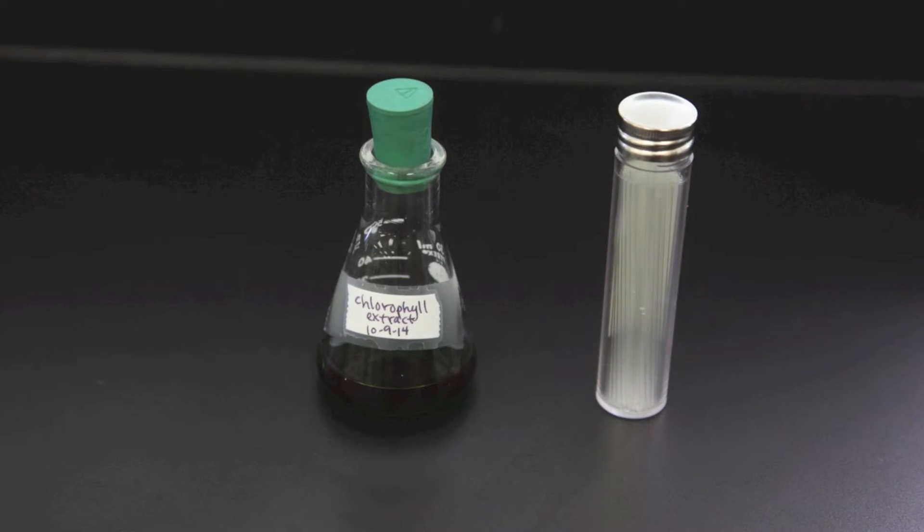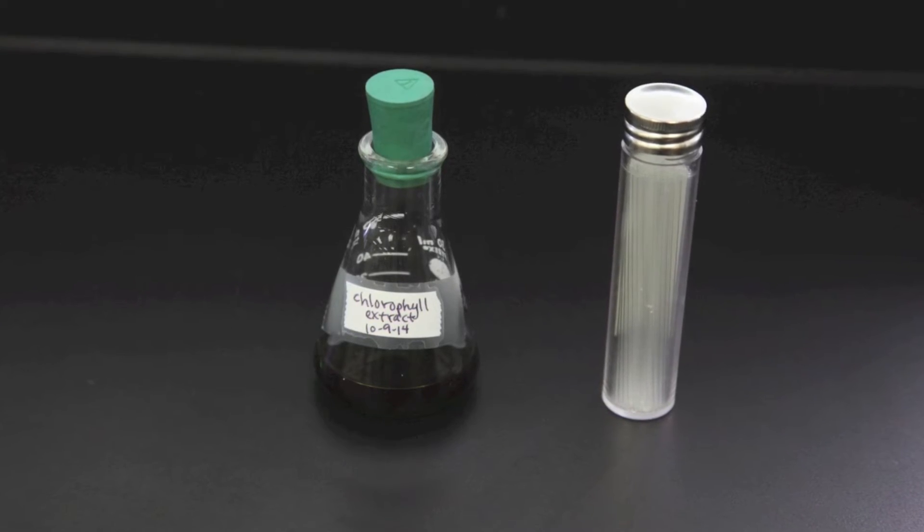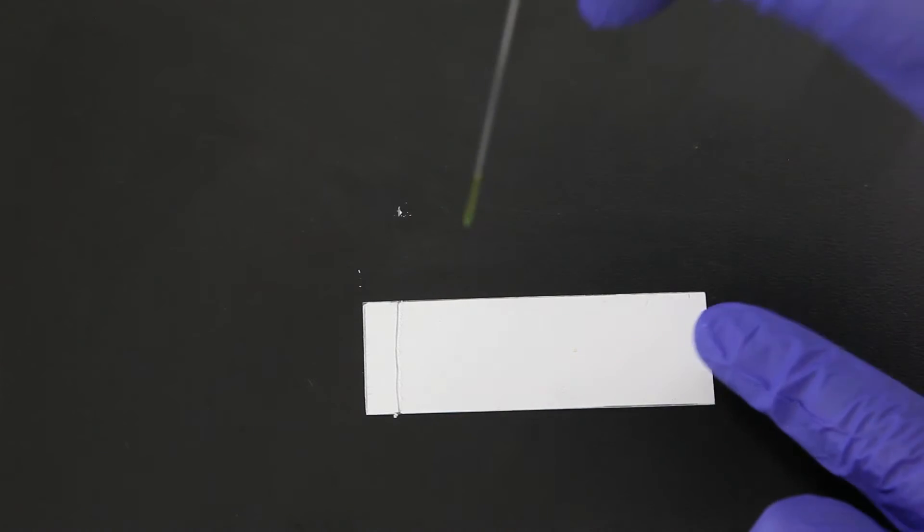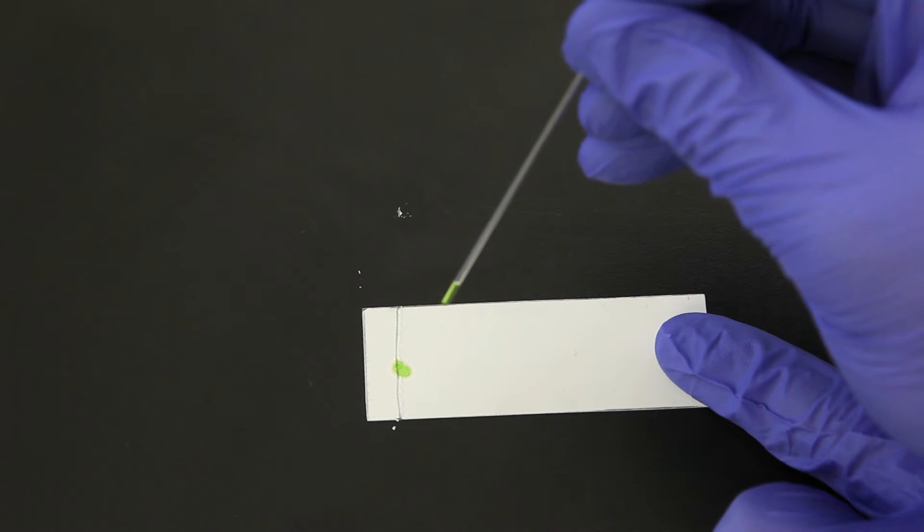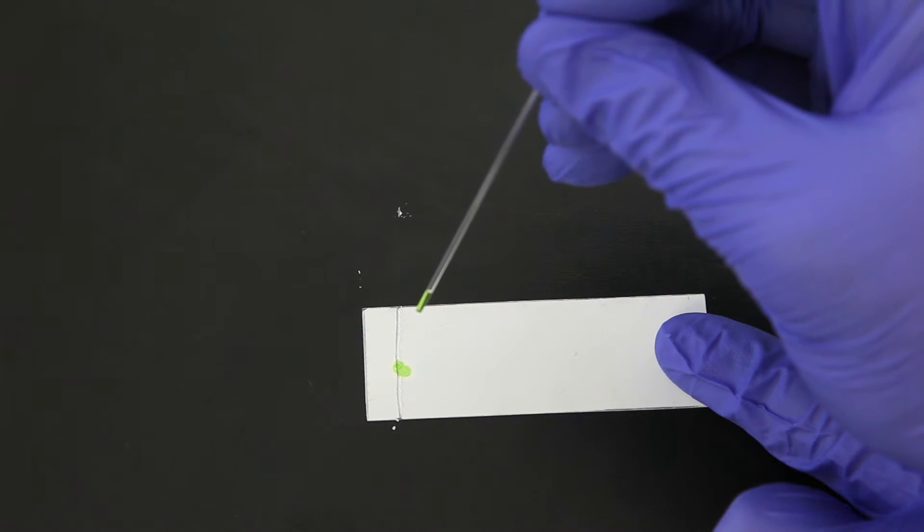Obtain a capillary tube and a bottle of concentrated chlorophyll extract. Use the capillary tube to apply a drop of extract in the center of the pencil line. Let it dry and reapply at least twice more.